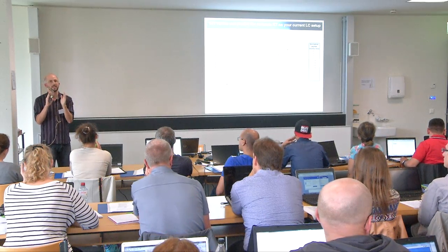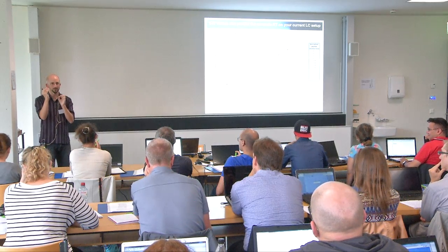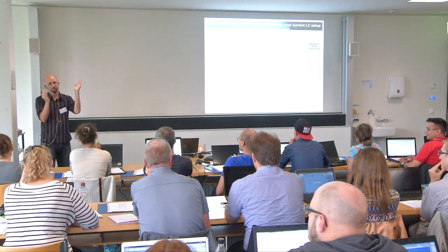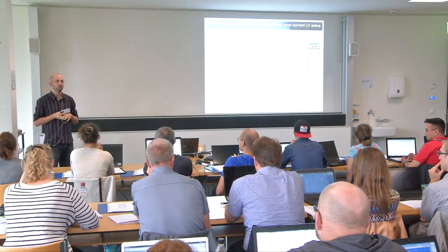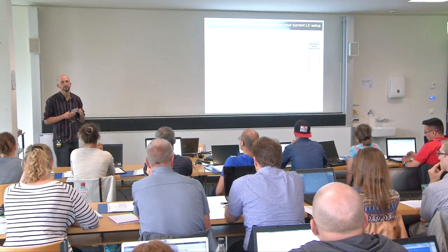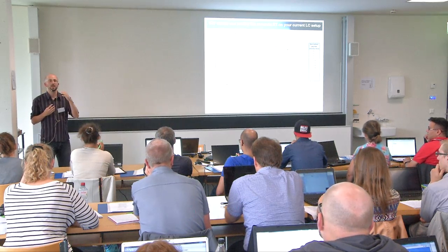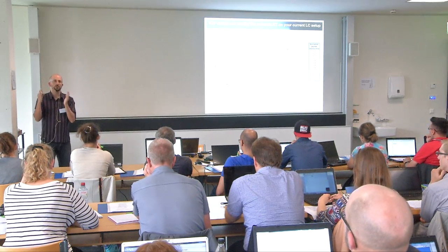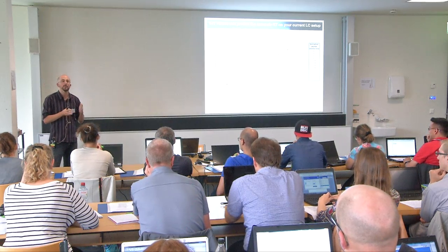So you could create two IRTs, a linear relationship between two types of standards, and then do two transitions. But it's a bit more complicated. But there are also situations where people did not measure with a retention time kit or any retention time standard, and after acquisition they try to standardize this using other peptides or something like this.